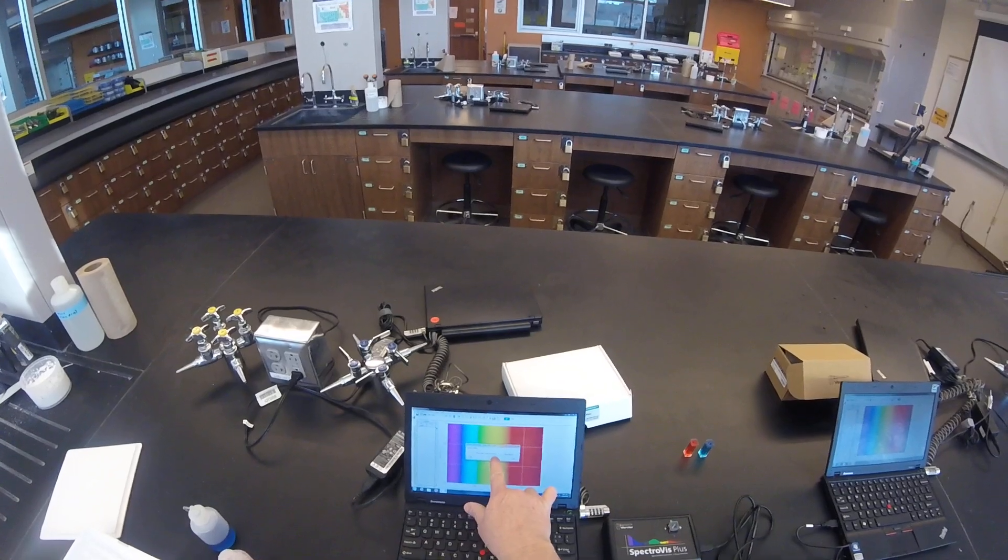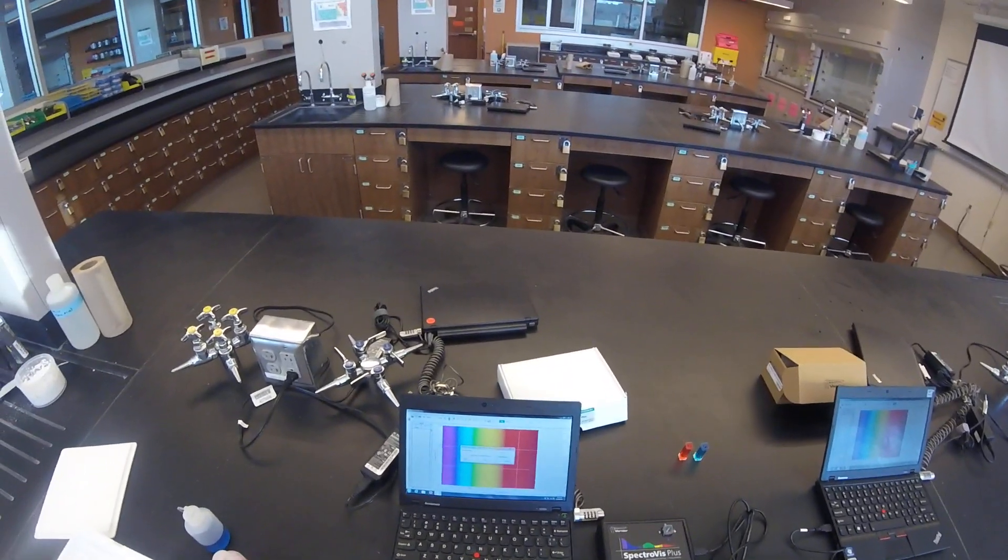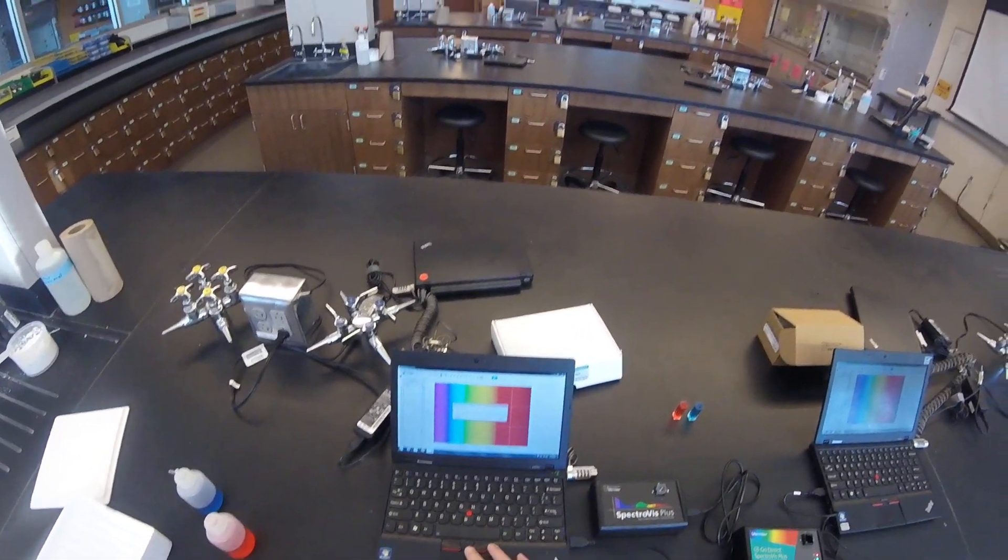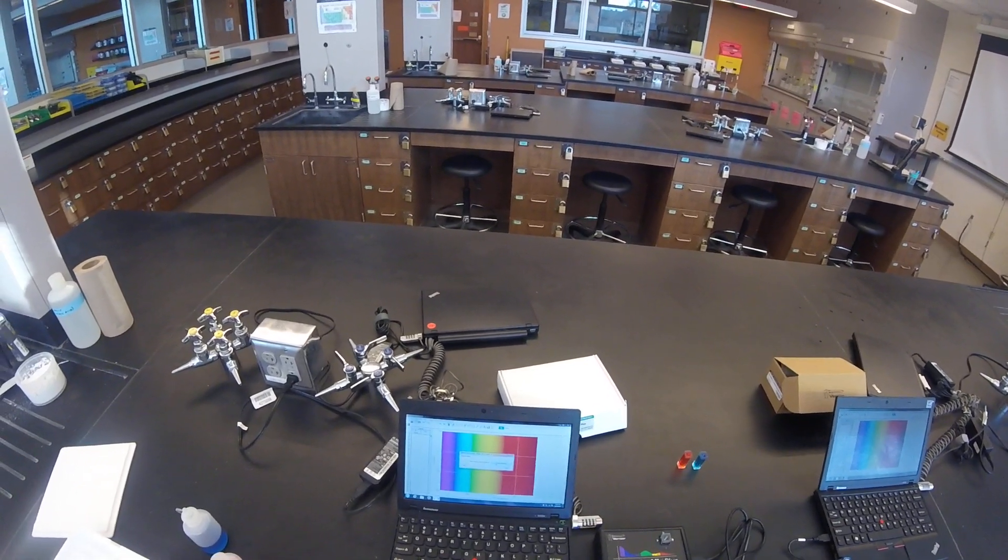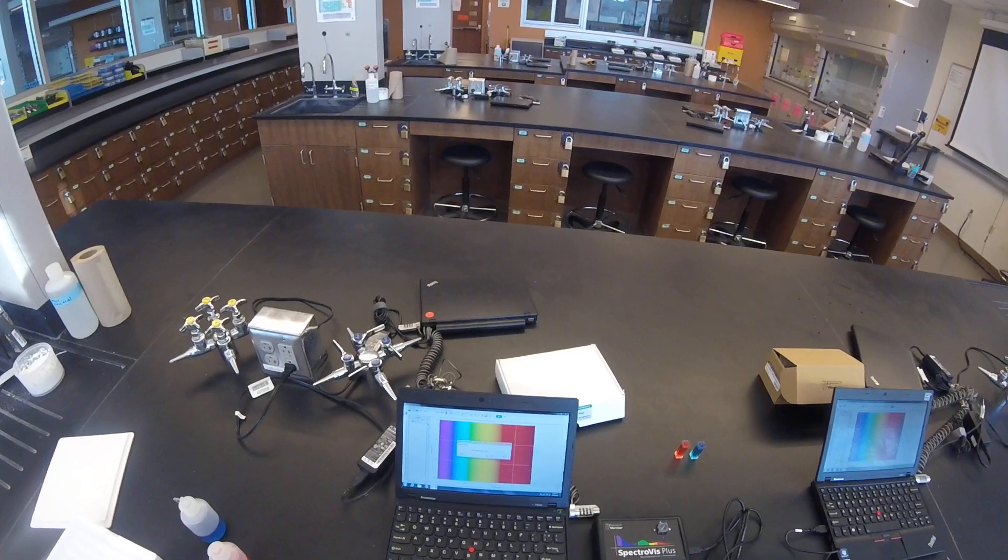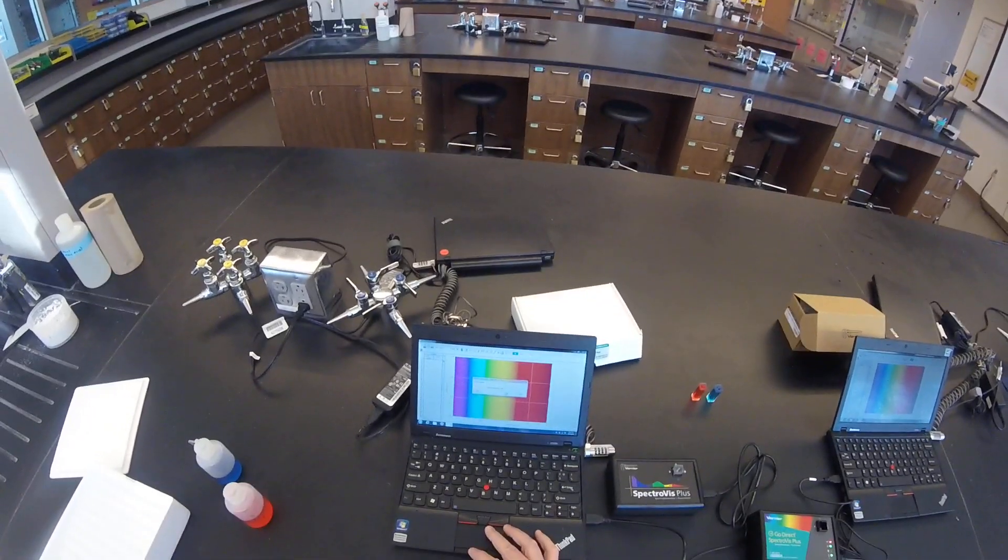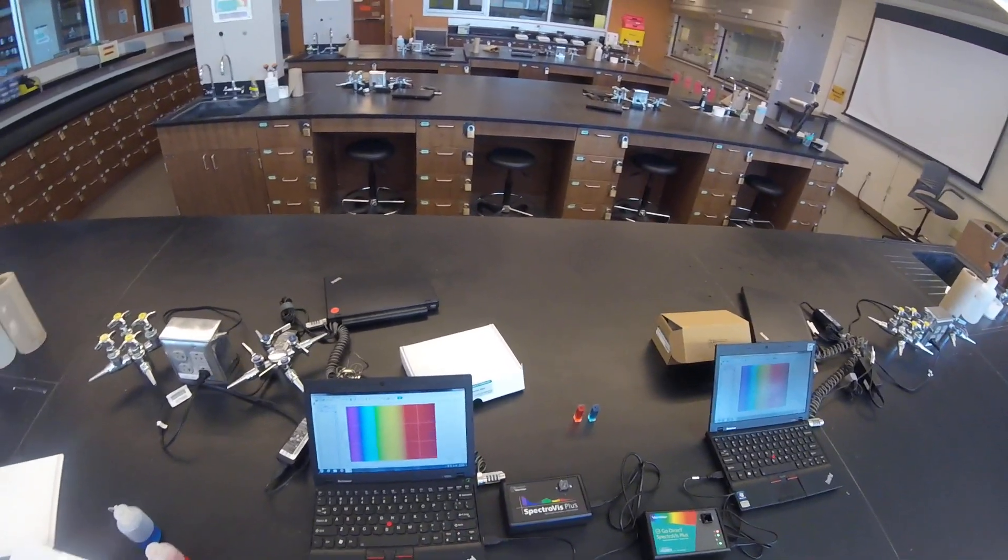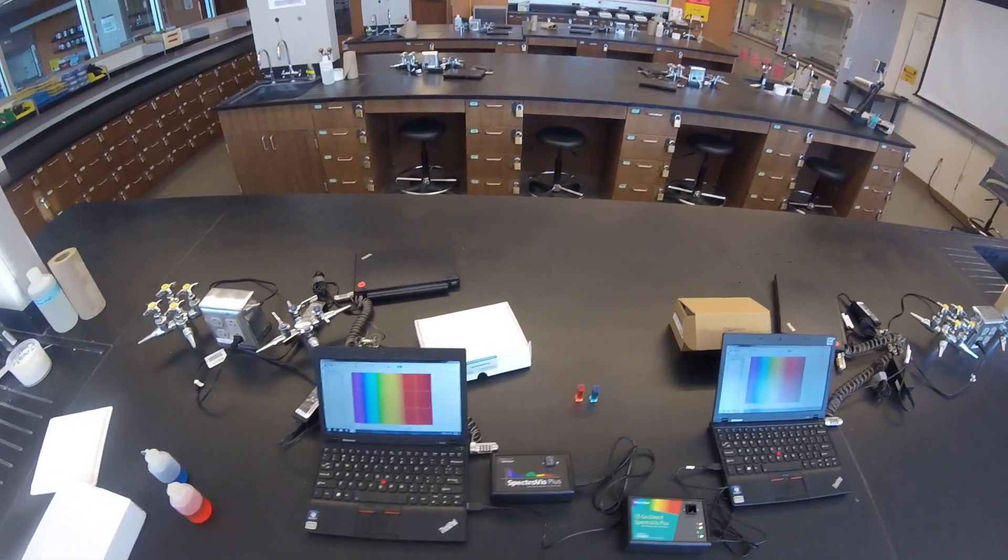It will tell you to place a blank cuvette in the device. My blank is already in there. With my blank solution, we'll click Finish Calibration. Give it a few seconds. And the OK button becomes active. And we click OK. We're now ready to actually use the SpectraVis Plus.